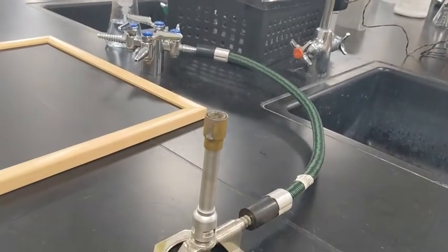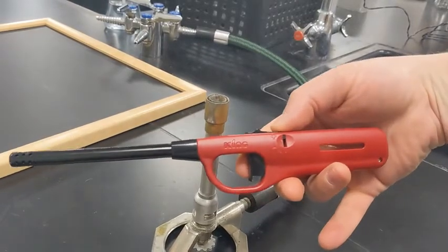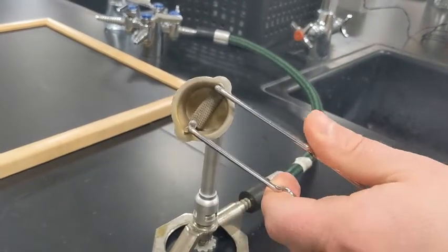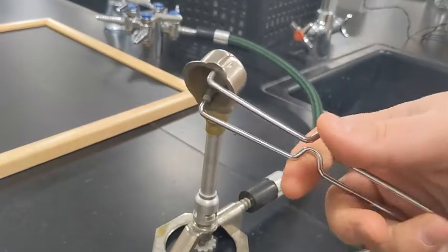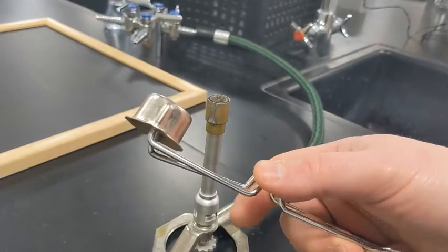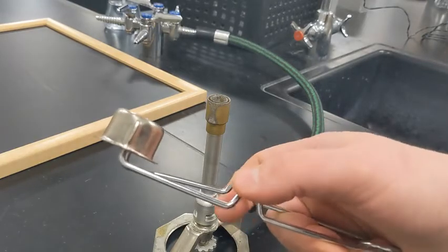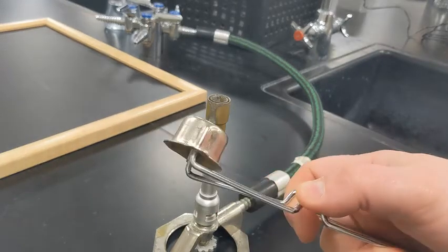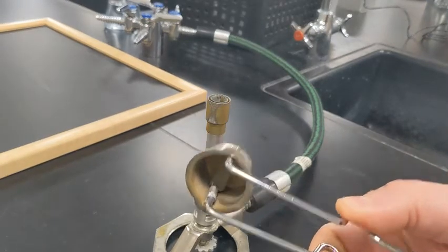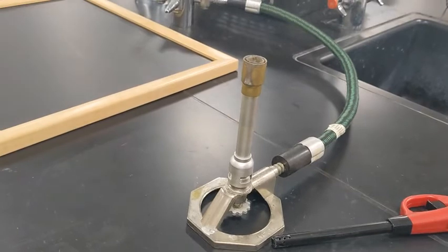When we go to light this, we can use one of two tools: either our aim-and-flame, or our sparker. If you're going to use a sparker, I like to put my thumb here and my index finger here — you kind of push down with your thumb and pull up a little with your finger. It takes a little practice but you get a nice spark. Some people prefer one tool over the other.